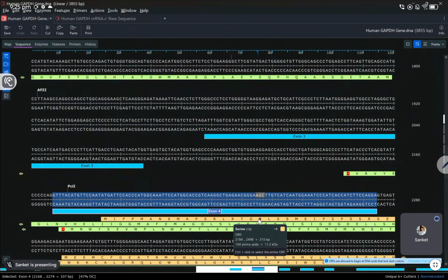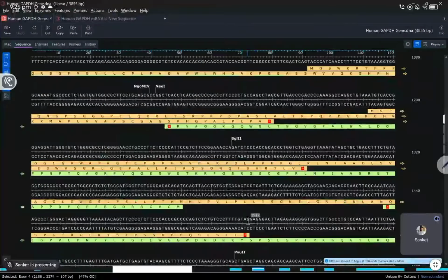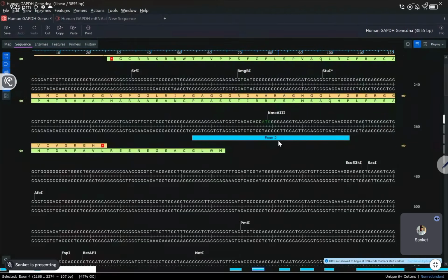Again, why are we choosing exon 2, 3 and 4 and not just 2? Because our exon 2 is very small. So we won't get many guide RNA options from designing guide RNA for this sequence alone. We need more options. Once we have more options, we can choose the best ones, and then from that you will be ordering 3-4 sequences which you will validate in your lab.